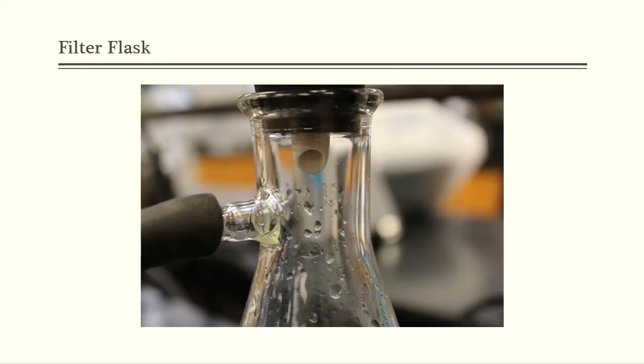Here's a close-up of below the Buchner funnel into the filter flask. The filter flask is collecting, of course, all of my liquid that's coming through. This nozzle is not draining liquid out. It's only pulling air through, and that's where the air is going to go. Otherwise, this flask would actually explode on me if there was nowhere for it to go. So the flask catches the liquid and the air goes out of the nozzle out the side. I never want this flask to fill up with liquid, by the way. That's a disaster in the making.